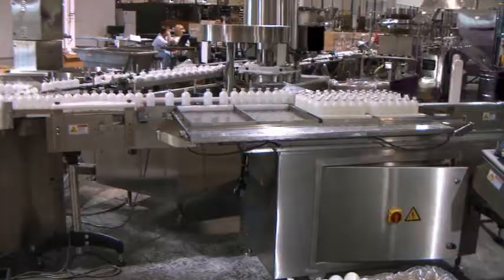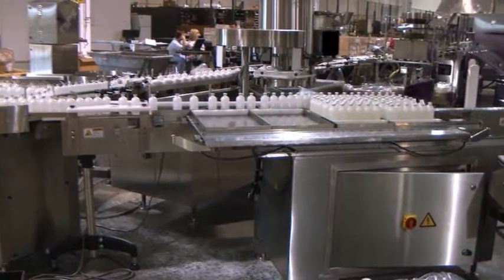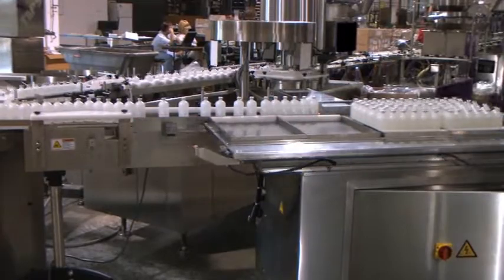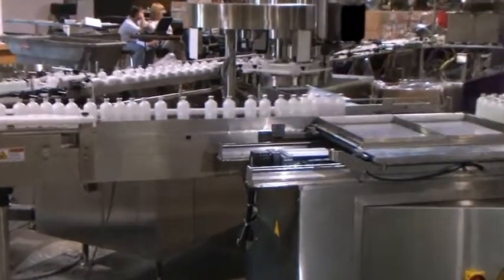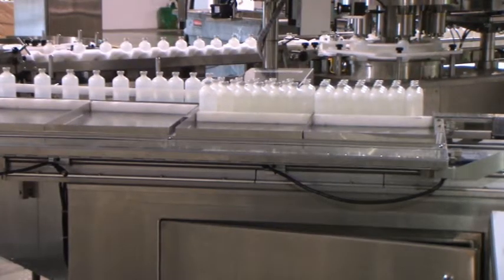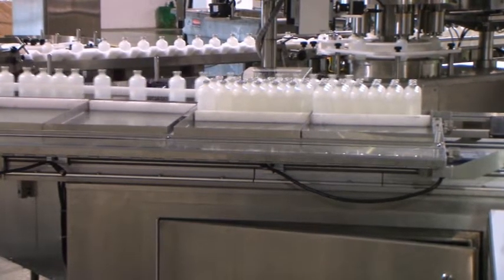The bottles are then conveyed to the BT400 tray loading system. Once the correct number of bottles are in the tray, the carriage indexes over, allowing a new set to be positioned in front of it.